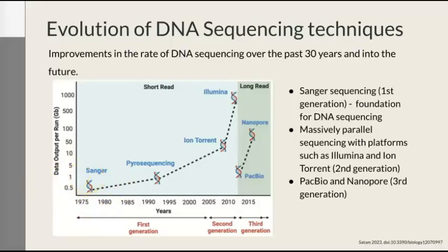And this became the gold standard for many years. Sanger sequencing was able to provide long, accurate reads. So it was really good for us to look at different regions, such as de novo sequencing or highly rearranged regions, such as in cancer genome.